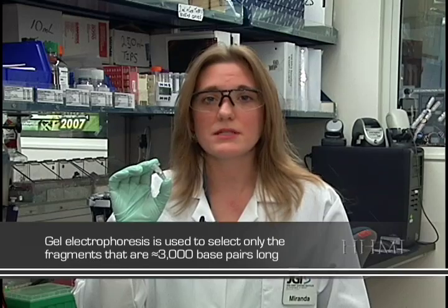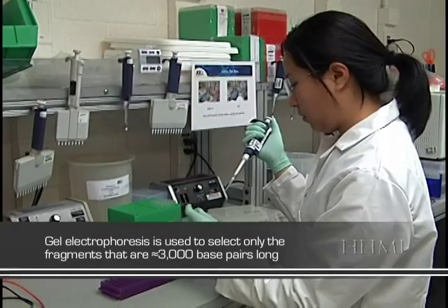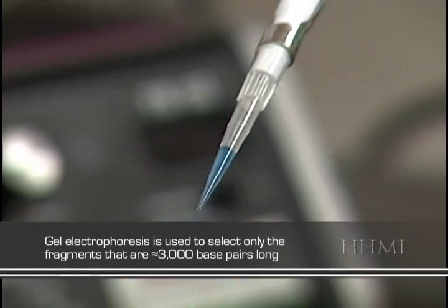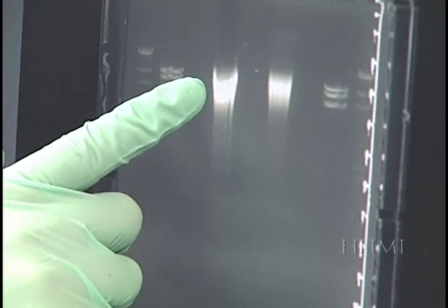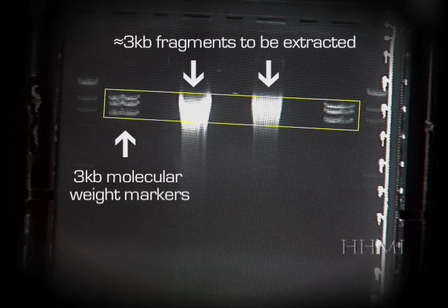We are only looking for fragments that are 3KB long. The Hydroshear creates a tight size distribution. However, there are still fragments that are too long or too short floating around in our sample. The sheared fragments are loaded into a well on an agarose gel. By way of electrophoresis, the different size fragments will separate based on their molecular weight. Once the fragments have separated, a technician using a molecular weight marker as a guide extracts the section of the gel containing the 3KB fragments.